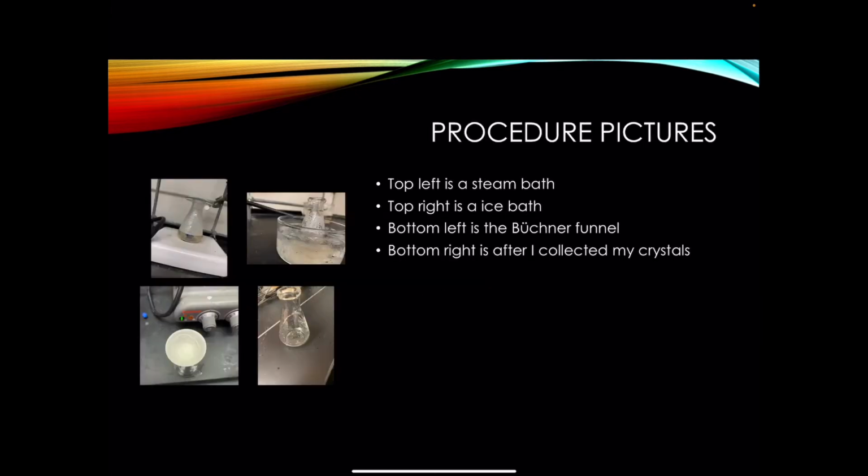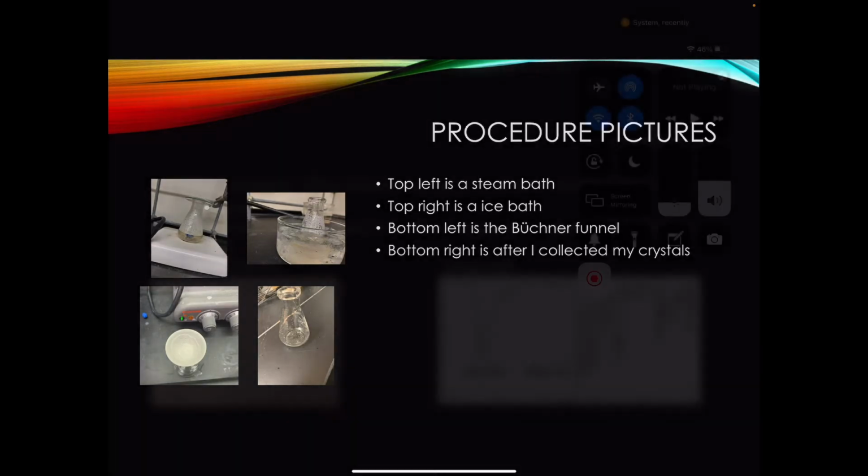Here are a few pictures from the procedure. The top left is the steam bath, the top right is an ice bath, the bottom left is the funnel, and the bottom right is after I collected my crystals.